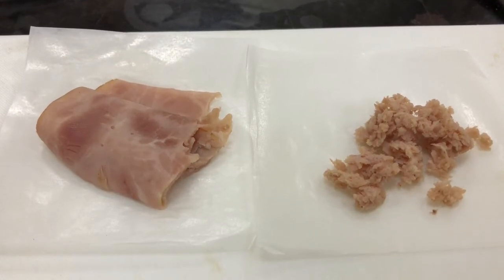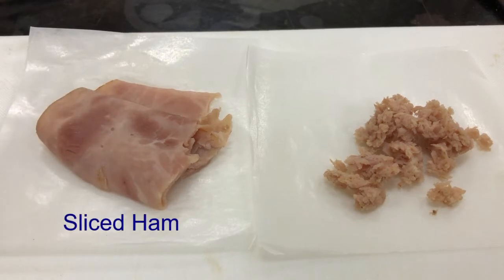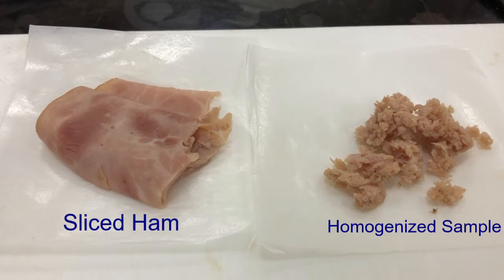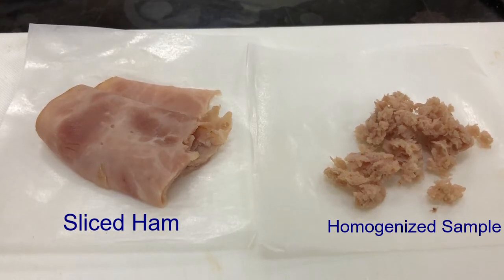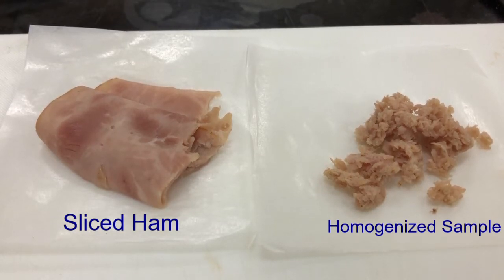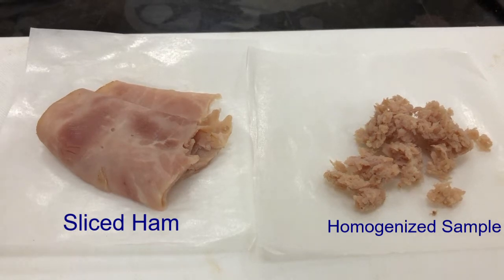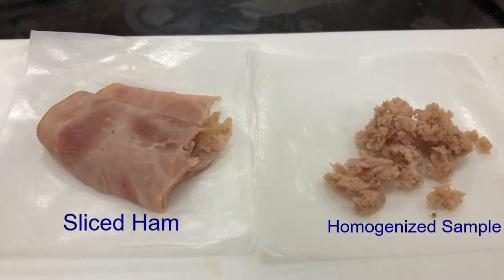On the left is a sliced ham product, and on the right is the same product but homogenized. I've just ground it up so that we have a homogeneous sample to use for our nitrogen determination. Now we're going to take a small amount, between 100 and 300 milligrams of the homogenized ham sample, into our digestion tubes.